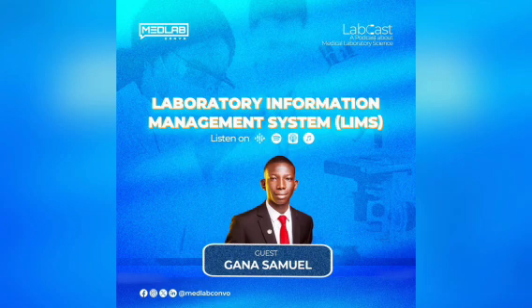A software program that interfaces with the machines. So, still with the example of HIV viral load testing that we're doing, when we go into the system, we load the sample into the system. It gives us a unique barcode for each patient. And so when we carry the samples to go and run them, each patient has a unique barcode with unique numbers. And these are the things that we do to ensure that we don't make mistakes.